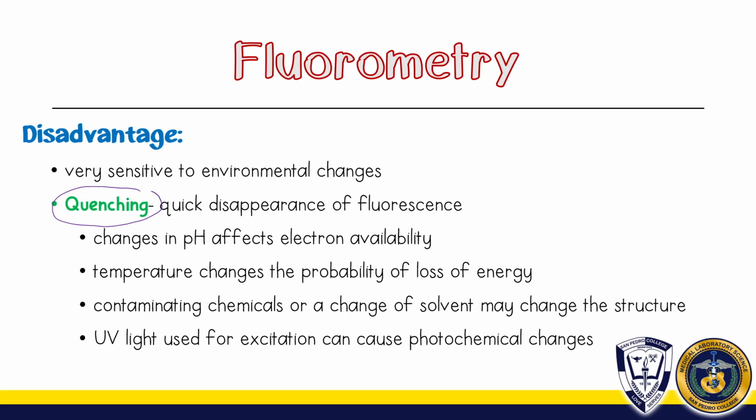So that is why fluorometry is not very famous in terms of its use in modern days.